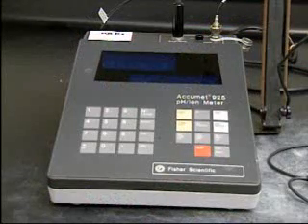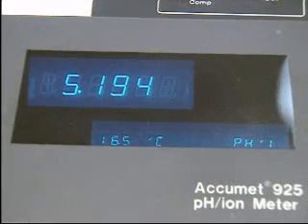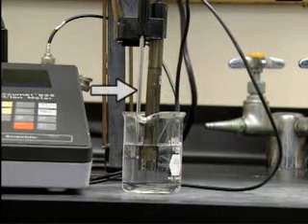And in some systems, the pH of processed liquids must be maintained at a certain value to prevent corrosion of system components. A pH test is typically made with a pH meter. This pH meter consists of a digital display, controls, a probe that is inserted into a sample to measure its pH, and a temperature probe.